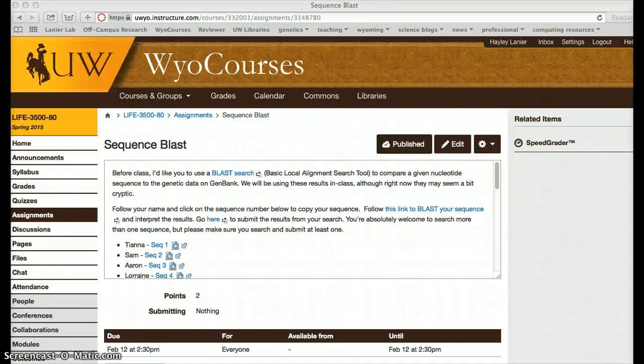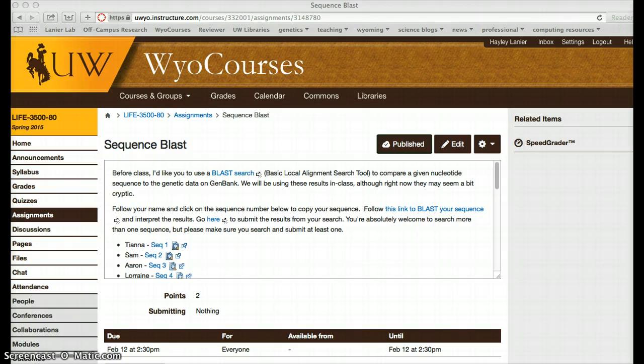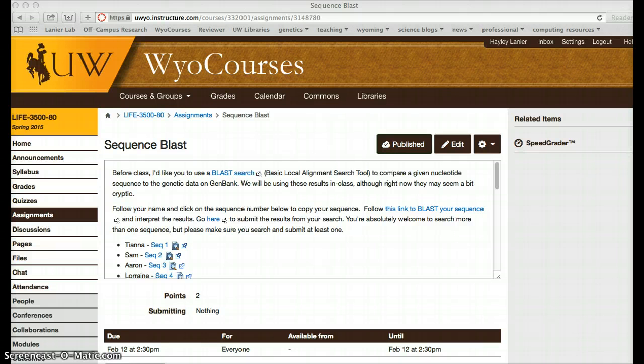Alright, so for class this week, you're going to be using a BLAST search. BLAST is a basic local alignment search tool, which is an algorithm for comparing biological sequence information, so amino acid sequences, proteins, or nucleotides and DNA sequences to a database.